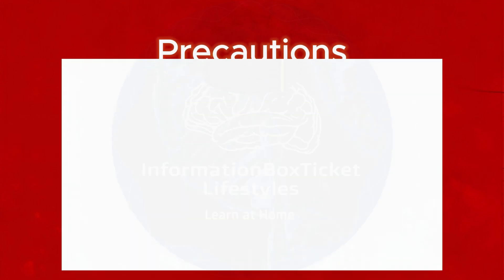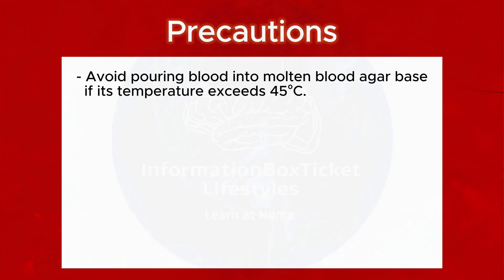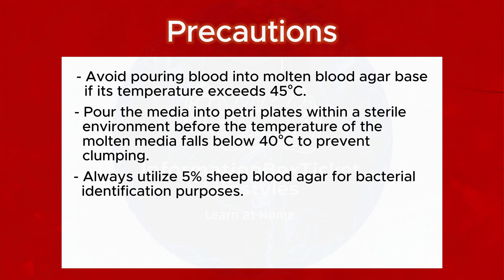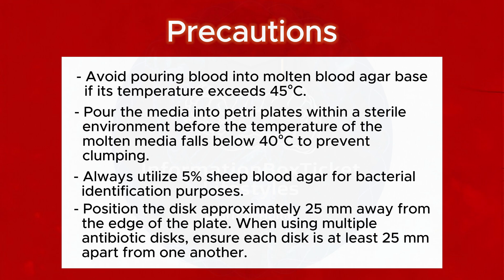Precautions: Avoid pouring blood into molten blood agar base if its temperature exceeds 45°C. Pour the media into petri plates within a sterile environment before the temperature of the molten media falls below 40°C to prevent clumping. Always utilize 5% sheep blood agar for bacterial identification purposes. Position the disc approximately 25 mm away from the edge of the plate. When using multiple antibiotic discs, ensure each disc is at least 25 mm apart from one another.